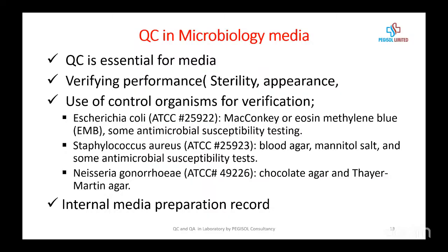So let's look at quality control in microbiology media. QC is essential for the media. The media where you grow these organisms has to be quality controlled. So you have to verify performance, like sterility test, appearance, and use of control organisms for verification.